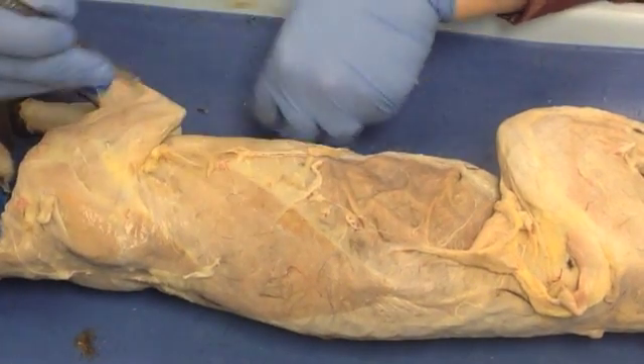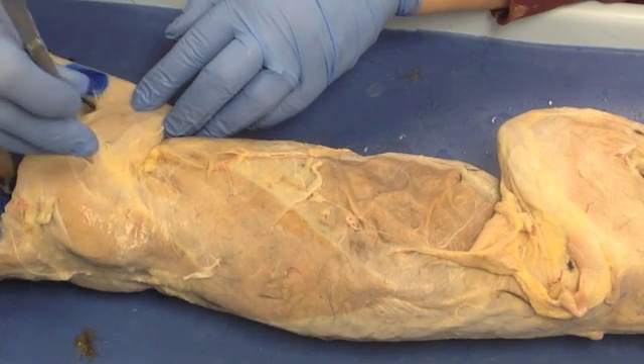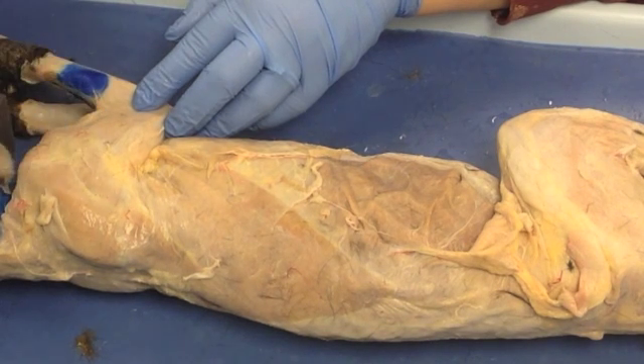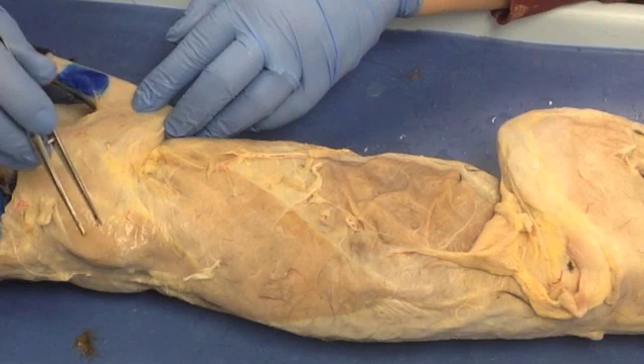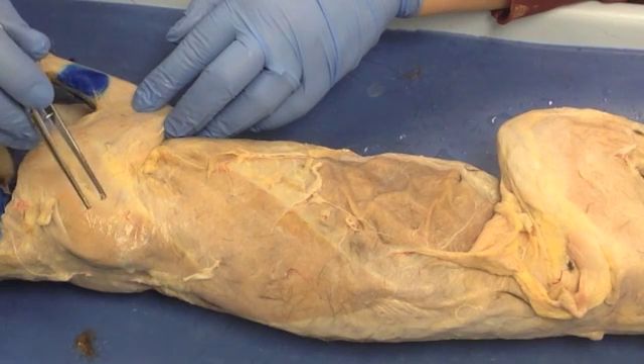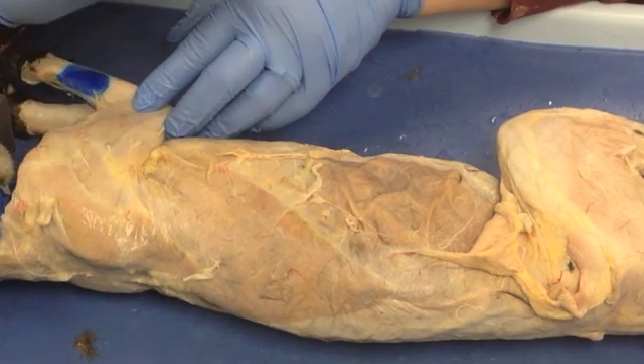The big thing to remember is that if you grab into something and it doesn't give easily, stop — because it's likely muscle and you risk tearing it. Finally, make sure you're using forceps as much as possible. Do not use your scissors to cut away something unless you are positive that you are not trimming away muscle.